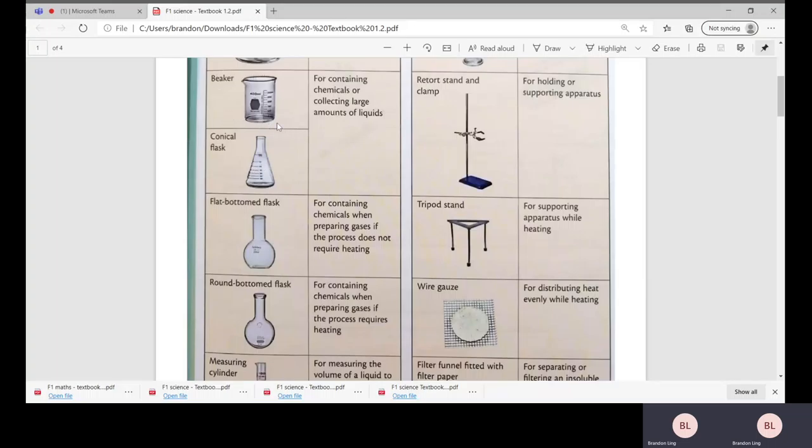Next we have the beaker or conical flask. They have graduations or different measurements on the glass itself. The functions are to contain chemicals or collect large amounts of liquids. On your right, retort stand and clamp.